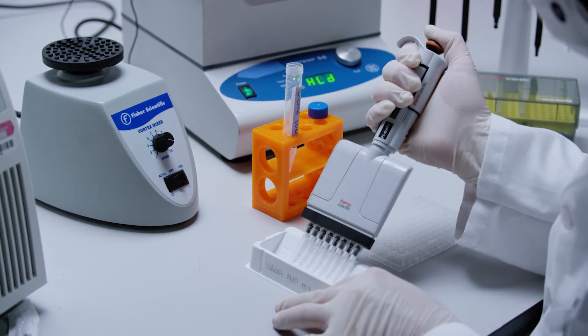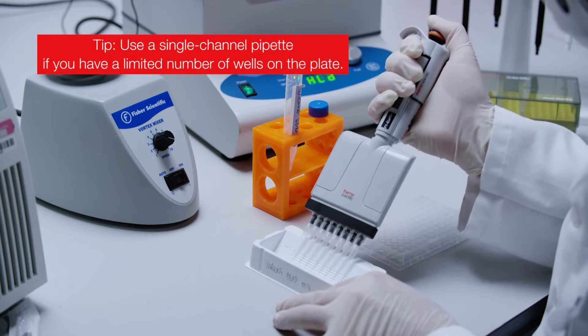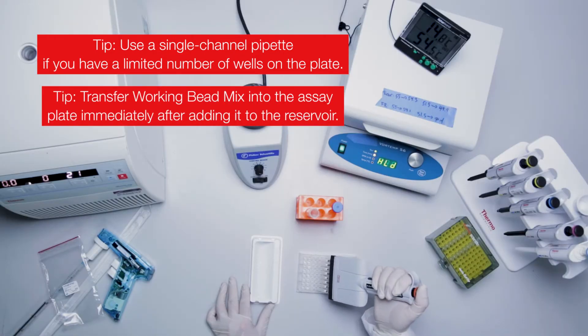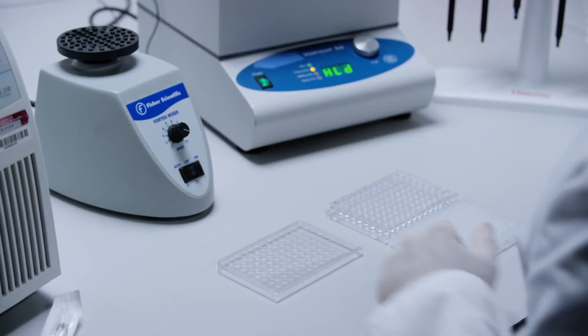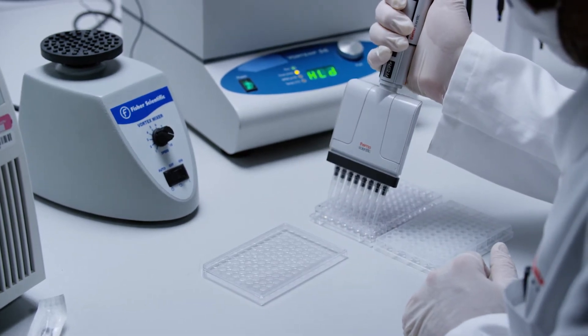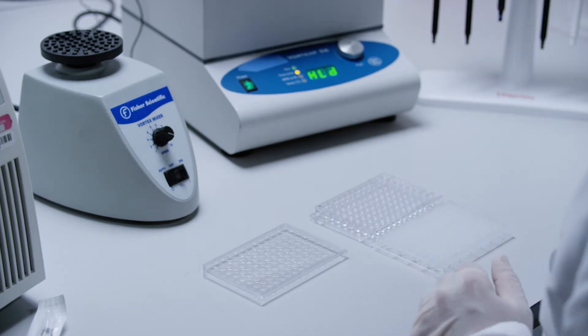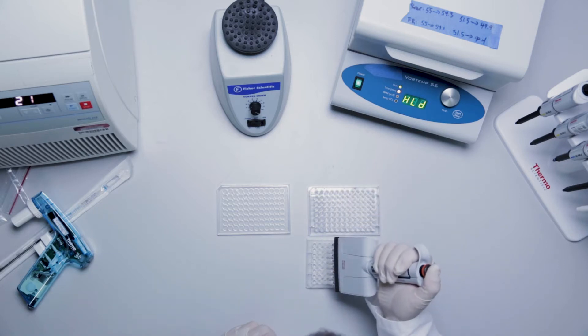Use a multi-channel pipette to pipette 20 microliters into each assay well of the round bottom hybridization plate. Now add 80 microliters of prepared lysate to each well of the hybridization plate containing the working bead mix. Make sure to change tips. The total final volume in each well will be 100 microliters. Be sure to include at least three wells for assay background.